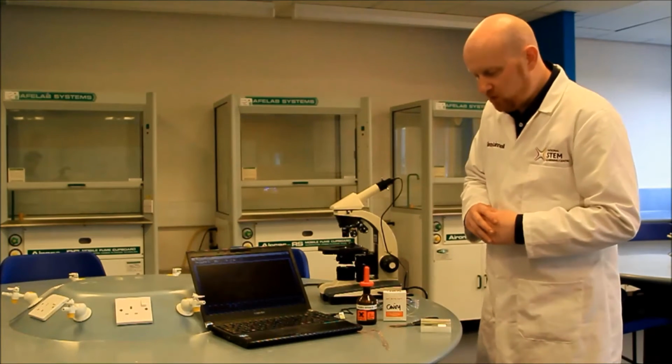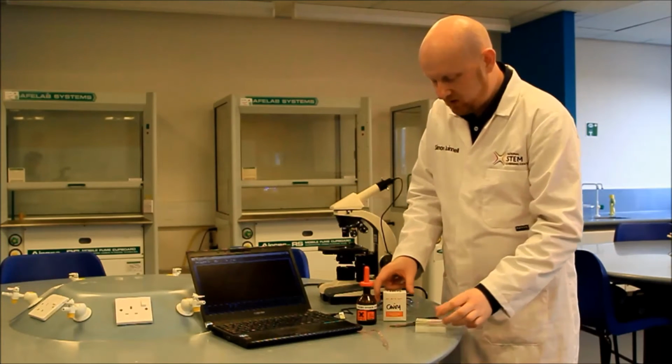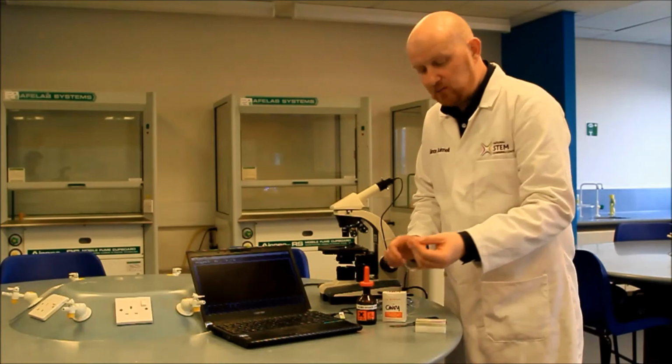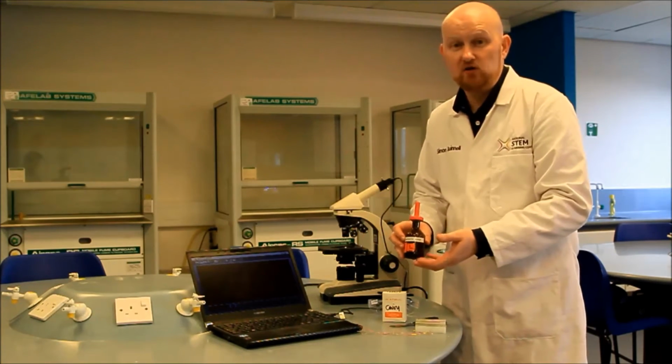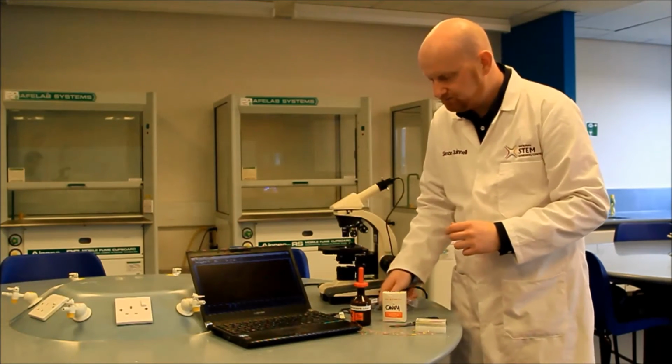It uses normal stuff that we'll have in the laboratories and the chemical store, and can be just a really inspirational demonstration. So we have, for this, some cover slips for our microscope slides, some cavity slides, some copper wire, and some 0.05 molar silver nitrate. So all standard equipment and some safety specs.